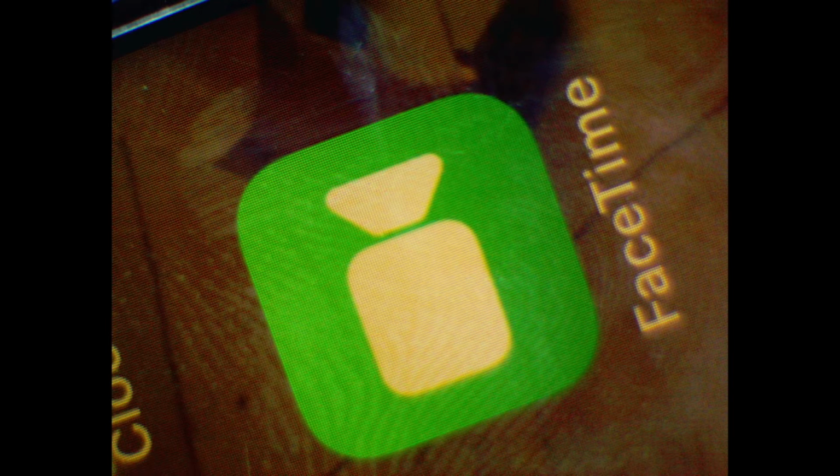The first microscopy image is this one. Can you guess what it is? How about we take a closer look at the following images after we're zoomed out of it? Yup, believe it or not, this is a close-up image of the FaceTime app on a phone screen. Let's take a look at the next object under the microscope. As we begin to zoom out, do the images start to offer any clues?